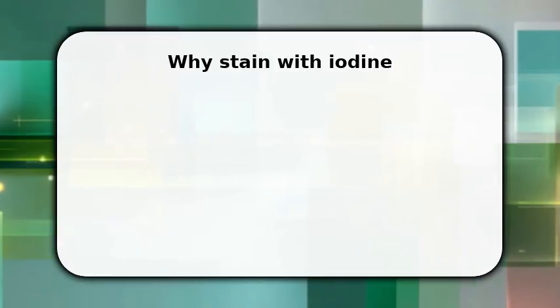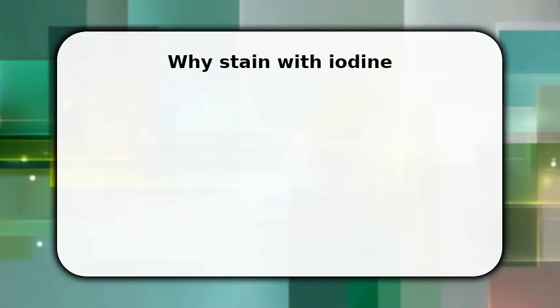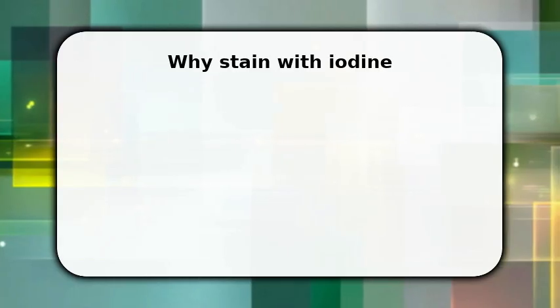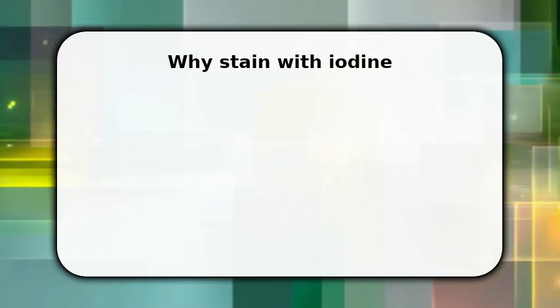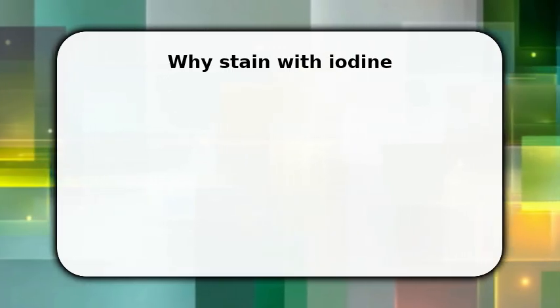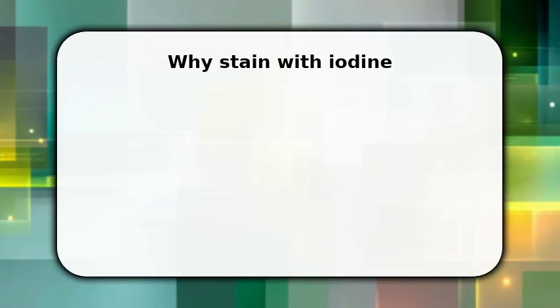Iodine stains cell walls and glycogen, increasing contrast under light microscopes. When you place a drop of 1% Lugol solution or gram iodine on a prepared smear, the dye interacts with polysaccharides and proteins to darken internal and surface structures.